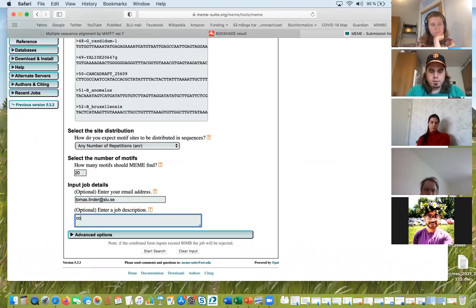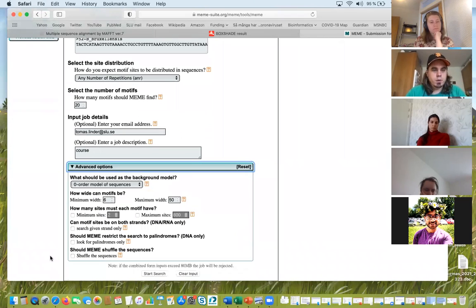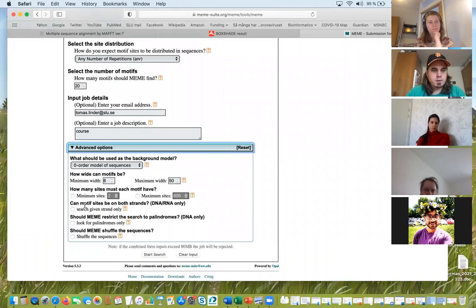And we call this course. I have 52 input sequences. So 52, half of 52 is 26, and double of 52 is 104. And again, what did I say? I said 5 to 22.